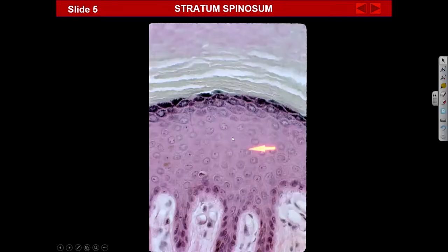Yes. Down here? Yeah, this is the basal going here. The stratum basale is going up and down on the epidermal side of the papillary layer of the dermis. So this is the papillary layer, the finger-like interdigitations of the dermis, right? So on top of the papillary layer in the epidermis is the stratum basale, like here. Okay, any other questions?